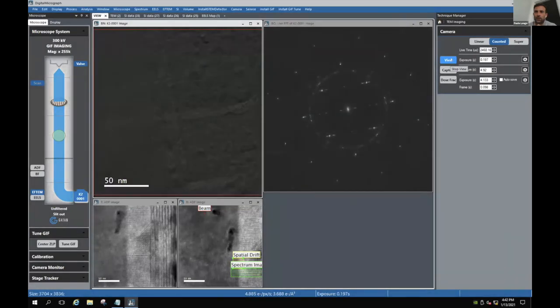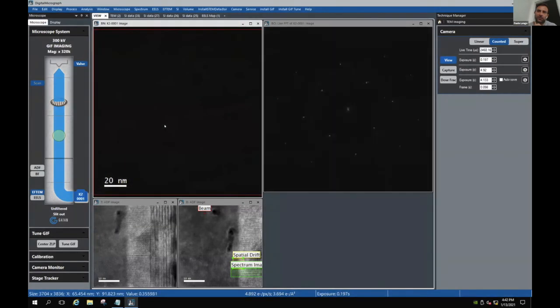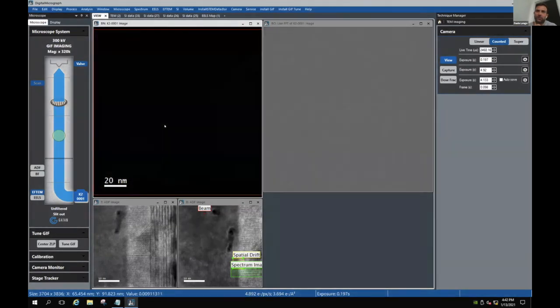Okay. Robert, can you go one step down in magnification? Or actually one step up. So let's look at this interface in more detail. We need a little bit more pixel. You can also use super resolution, which, to be honest with you, I never tried.